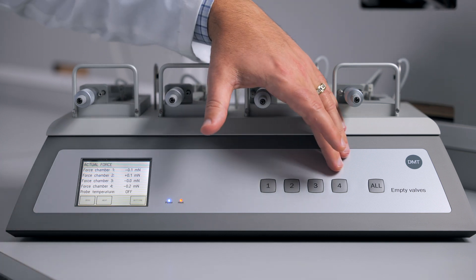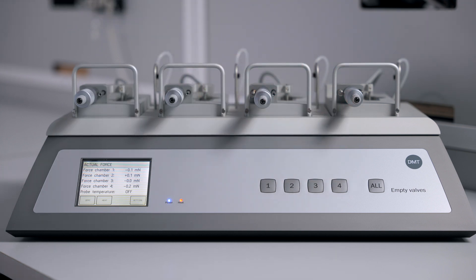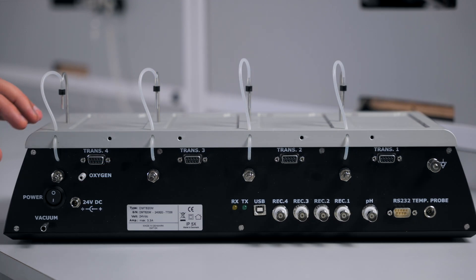The buttons on the front allow you to empty the baths in any chambers, or use the ALL function to empty every chamber. The back of the interface has all the connections to fully utilize the system.